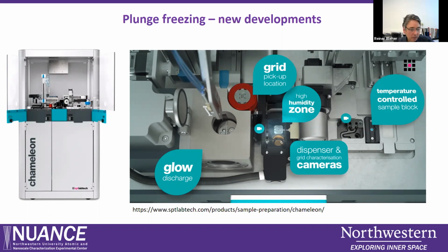But this new device has so far only been used with samples for single particle analysis, and there is not really a usage with larger samples so far. But there is a chance that this device would also work with larger samples, and this might make it attractive to you. Just wanted to give you an idea about new developments here.